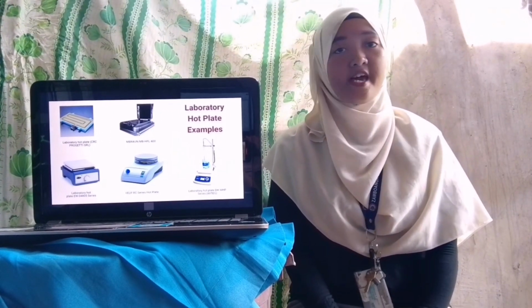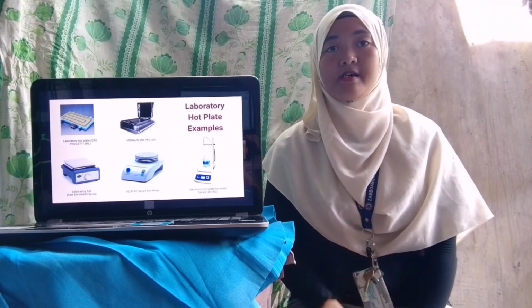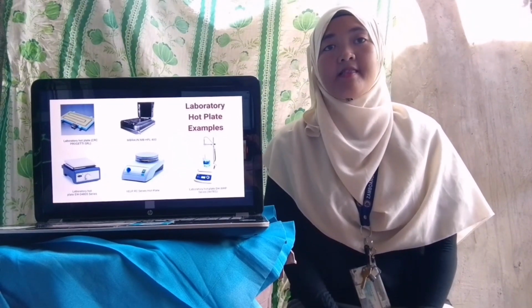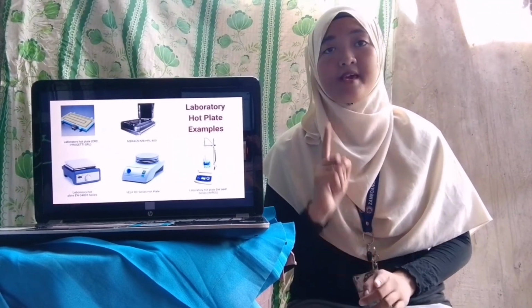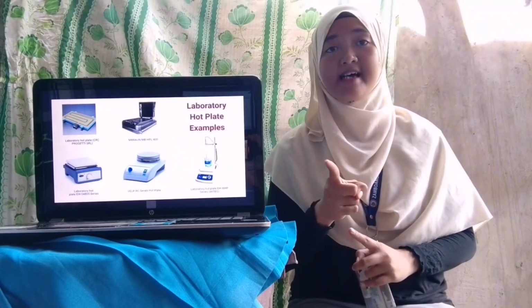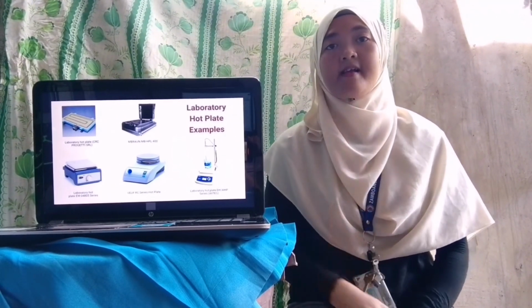The next is to check the thermostat for corrosion, which can also result in sparks. Unplug the device while not in use. Use only borosilicate glassware that can withstand heat, and inspect it for cracks before heating. Never put a jar, soft glass, or glass flask directly on the hot plate. Make sure that the plate surface is bigger than the item being heated. And last, never use a hot plate to heat foil or metal pans, because sparks and surface damage are both possible effects.